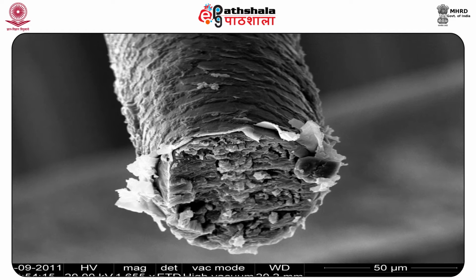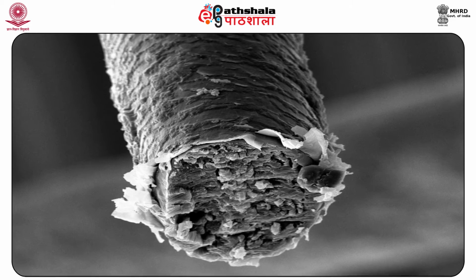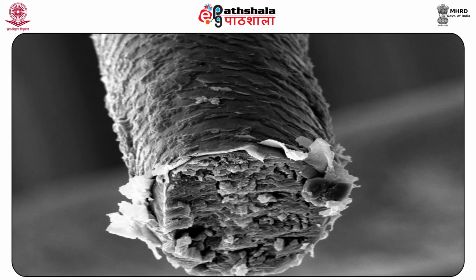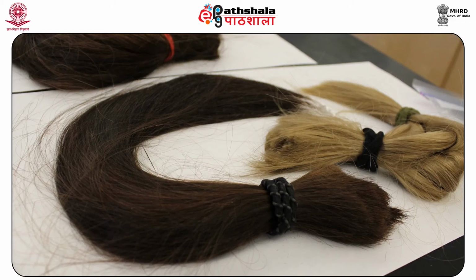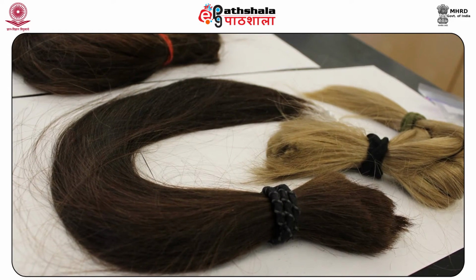The detailed microscopic examination of hairs is done after cleaning them in an alcohol-ether mixture or acetone. They are then mounted in Canada balsam on a microscopic slide and examined with a magnification of about 400x. The examination reveals the actual color of the hairs. The contamination, which may be masking the real color of the hair, is removed in the cleaning process. Then we can tell whether the hairs have been dyed or bleached. The natural color of the hair is found near the root end.